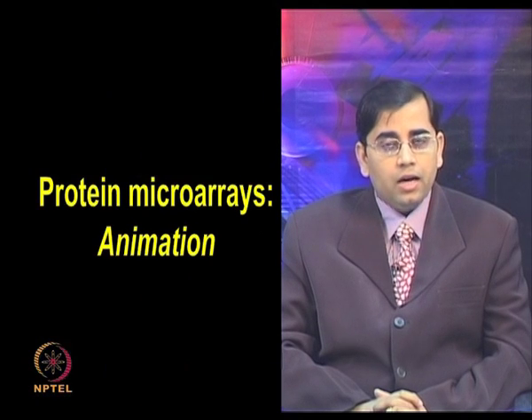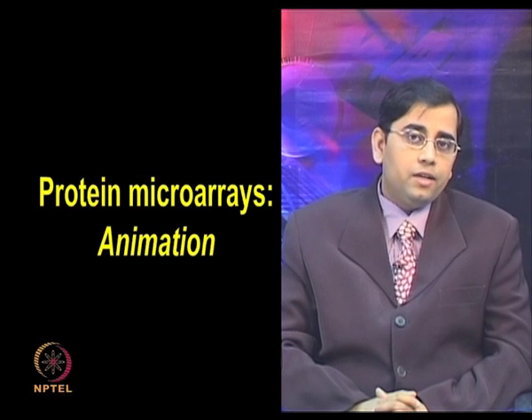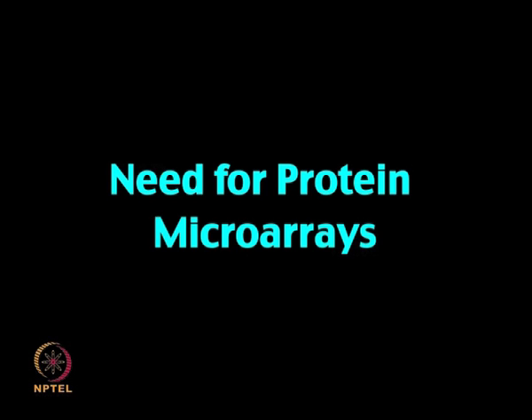So, the development of functional protein microarrays on which thousands of discrete proteins are printed at high spatial density offers a novel tool to integrate protein function in a high throughput manner. In this animation, I will discuss the different features and processes involved in protein microarrays. Before we talk about protein microarrays and how they are generated, let us discuss the need for protein microarrays.